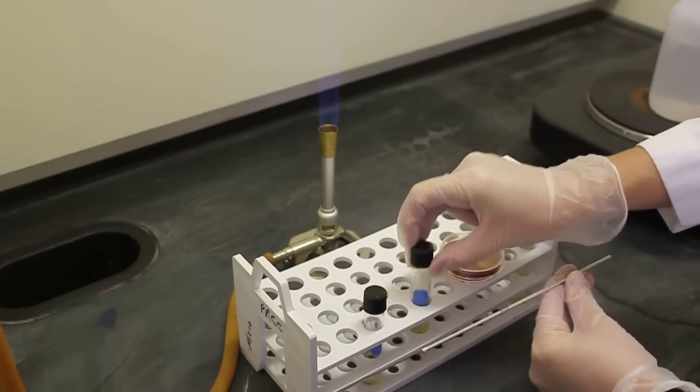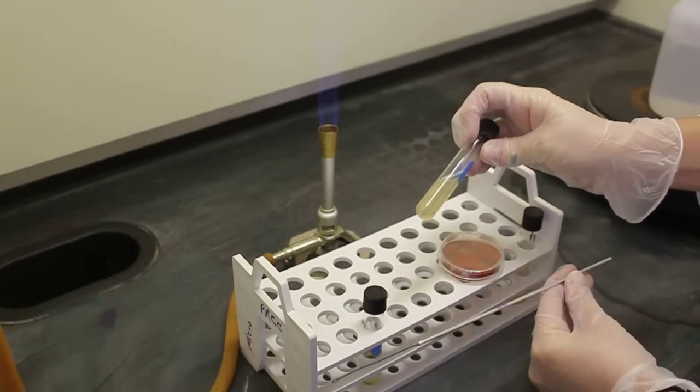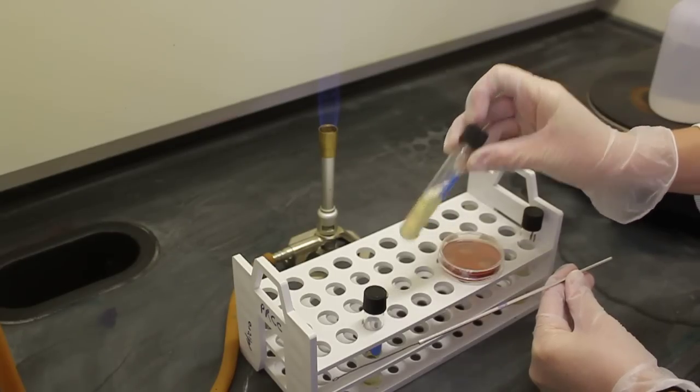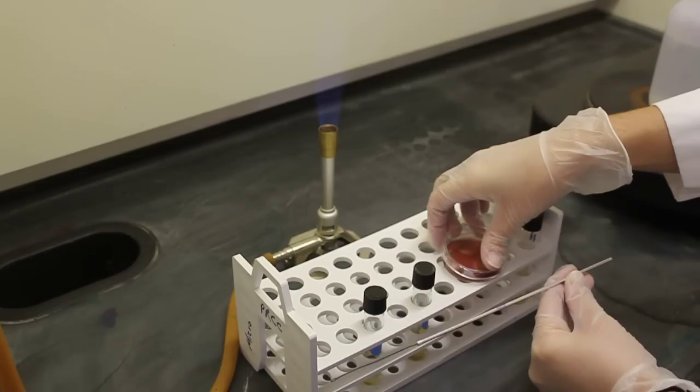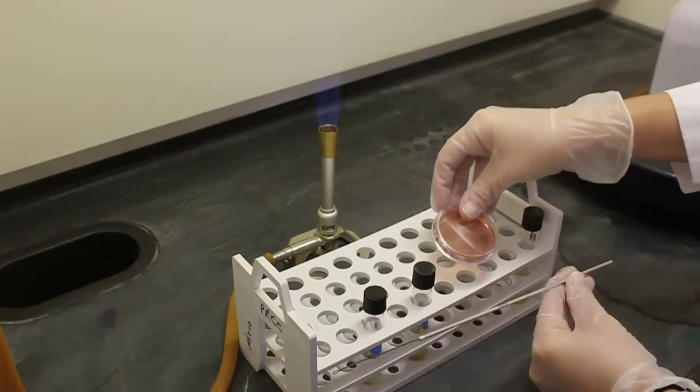We use solid media in a test tube. This type of media is known as a slant due to the slanted appearance of the media in the top of the tube. And when solid media is in a petri dish, this is called a plate.